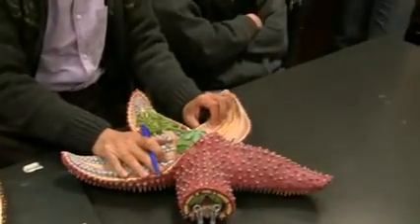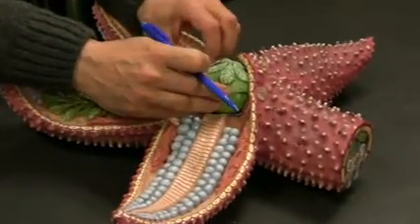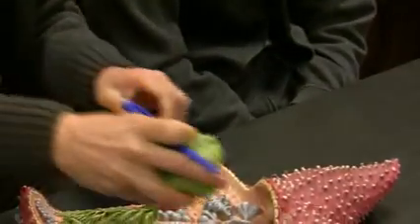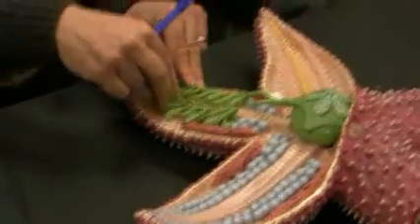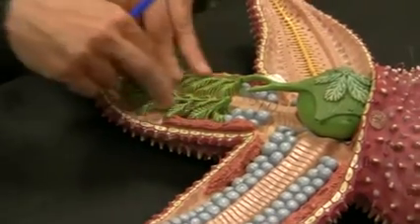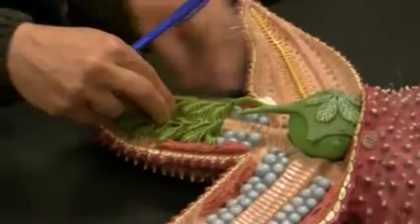Starfish. I have not talked about it, but today we will lecture over it. Stomach. There are different portions of the stomach here. I don't expect you to know that. Just remember, this whole entire thing is stomach. They have a pyloric stomach and other parts, but don't worry about it. Just stomach. And these would be digestive glands or gastric cecum. There are 2-3 different names your lab manual and your textbook mention. So digestive gland is fine.